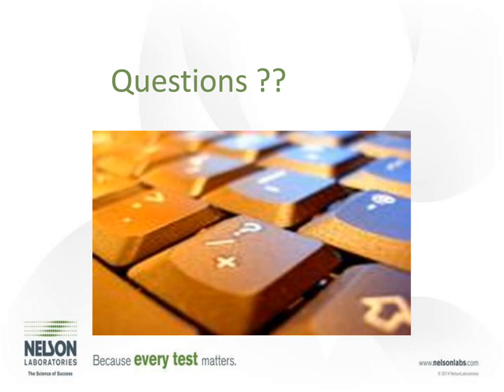Great, thanks for that. What TAT is perceivable for the in vitro test? I'm sorry, can you say that again? What TAT is perceivable, turnaround time? So right now the turnaround time for this test is about two to three weeks. The hard part is the tissue itself. The tissues we have to use right away, so we can't store them. Once an order comes in, if your device gets sent in for testing and it's in between orders, then it might take a week before we can get started. So two to three weeks right now is the turnaround time.